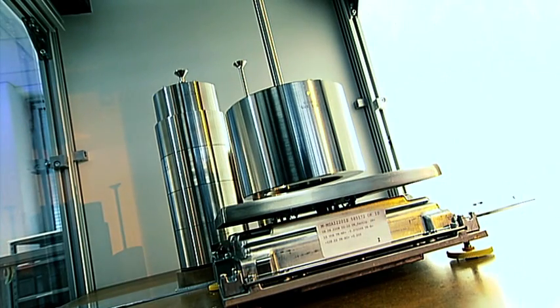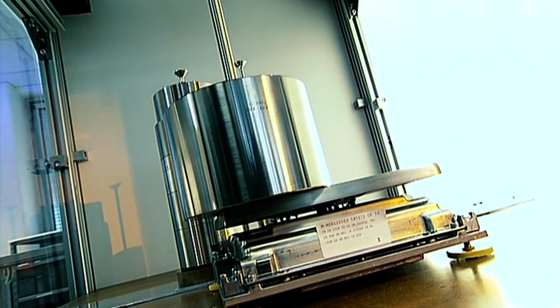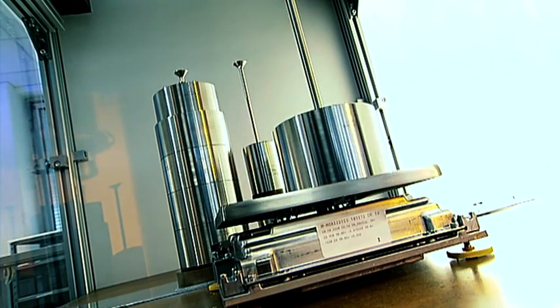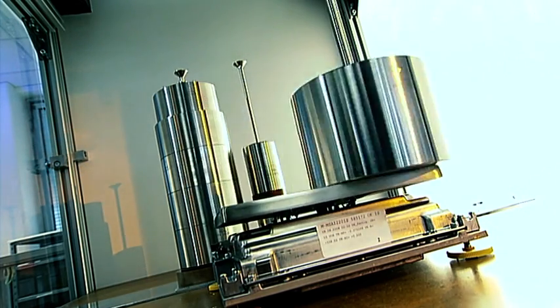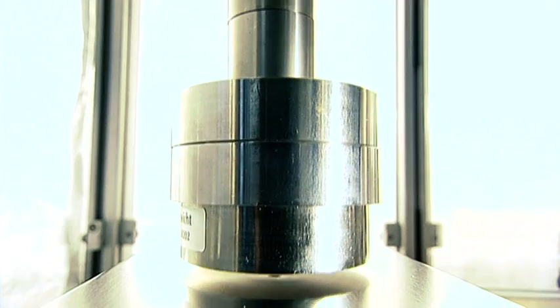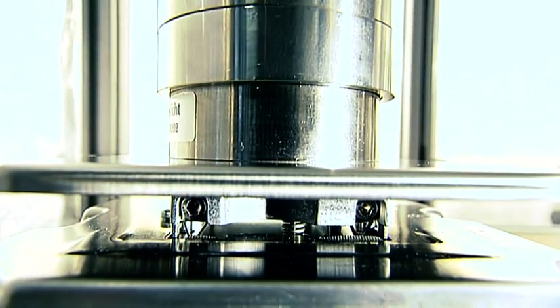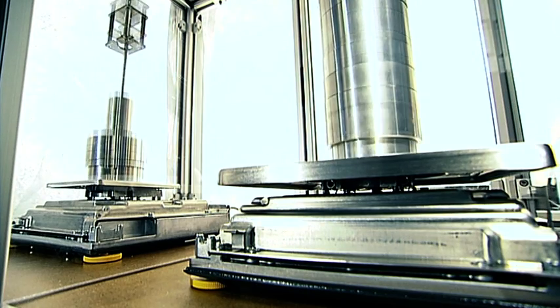Developing a digital off-center load compensation system represents a two-fold achievement. On the one hand, a significant reduction in off-center loading error. On the other, the use of larger weighing pans.